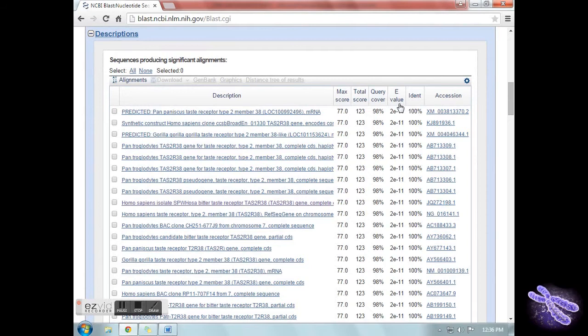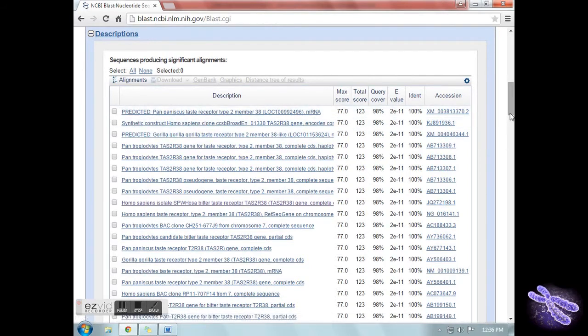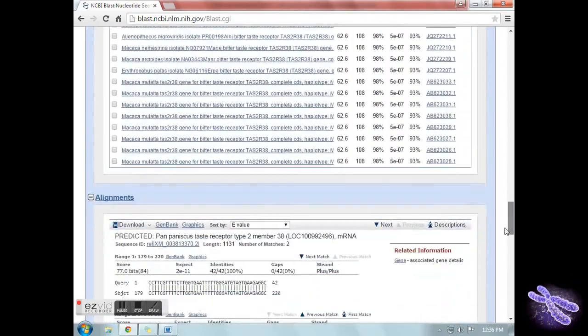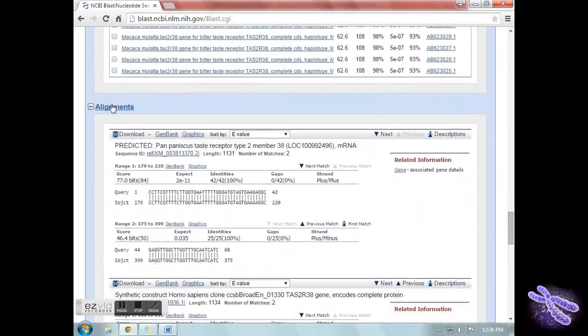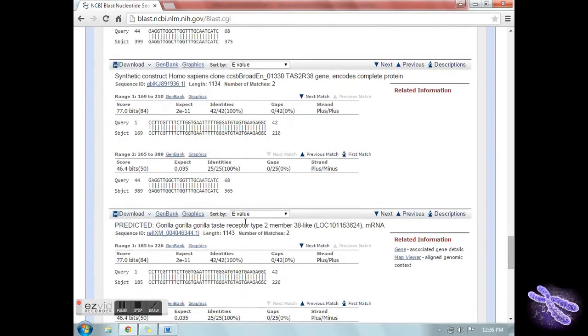Second is a list of significant alignments with accession information. Take notice of the E value. And last is a detailed view of each query sequence aligned to the sequence you searched.